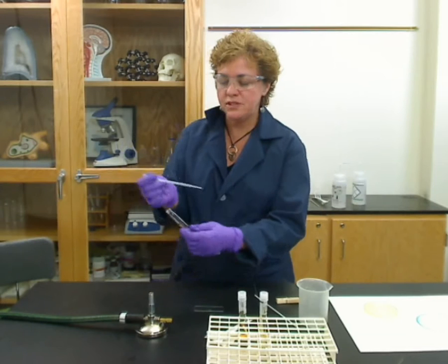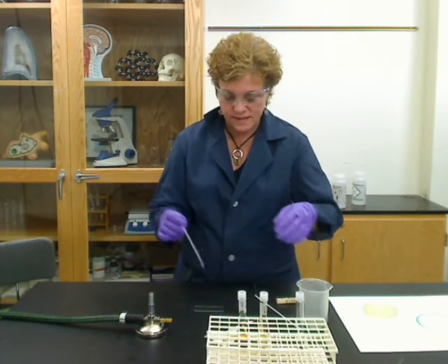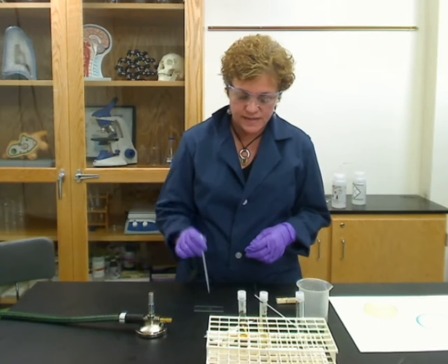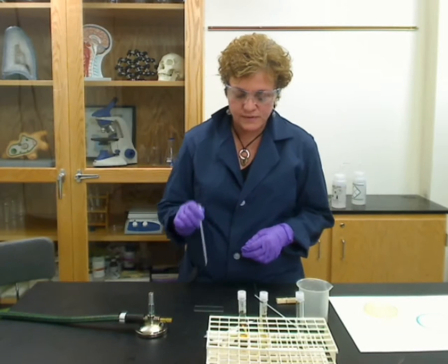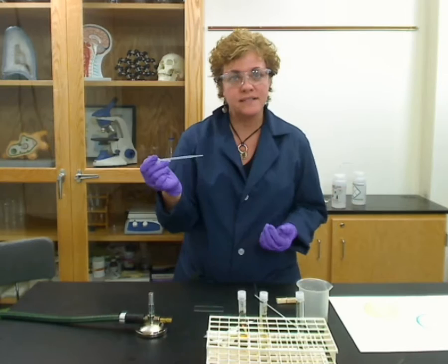Flame the tube before you close it so it stays sterile. Then just touch that dropper to the slide. If there's too much water — and there usually is — you can suck up about half of it with that same dropper. Now this dropper you're going to end up throwing away, because it's no longer sterile.